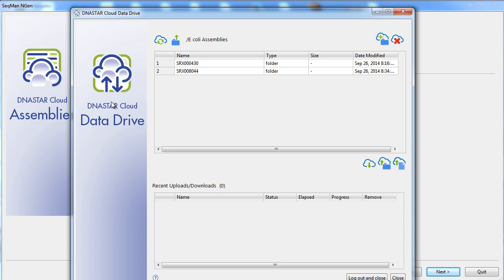For this example, I'll demonstrate how to run several reference-guided bacterial genome assemblies in parallel. I've already uploaded some data from two different strains of E. coli.